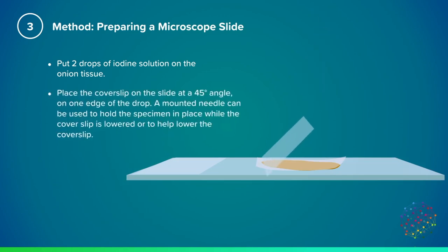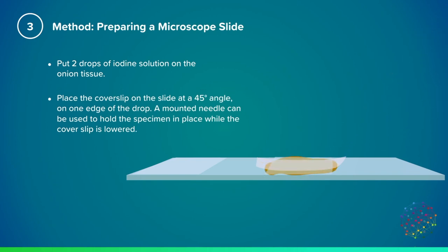You can now place your cover slip at a 45 degree angle to the slide. Use a mounted needle to now either hold the onion flat on the slide, or help you lower down the cover slip. Lowering the cover slip gently reduces the amount of air bubbles you get underneath it.